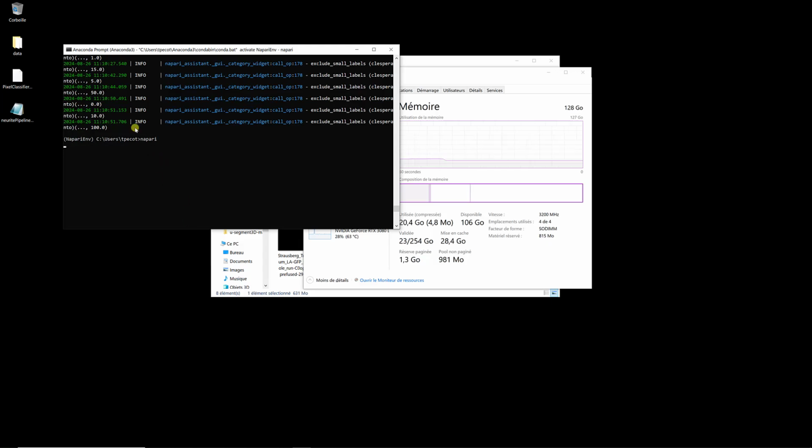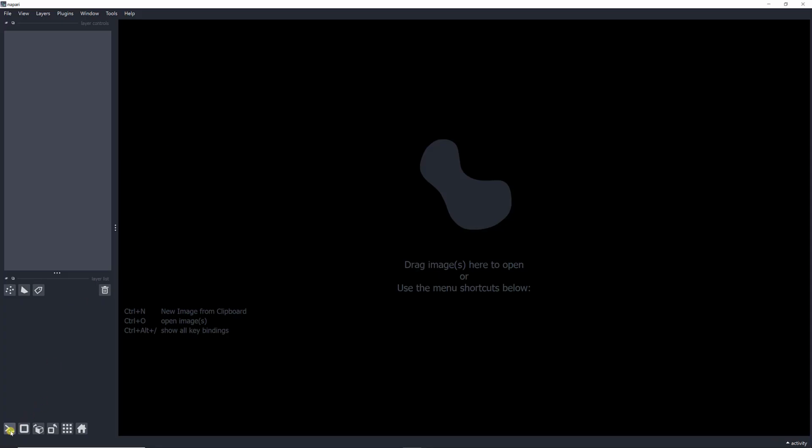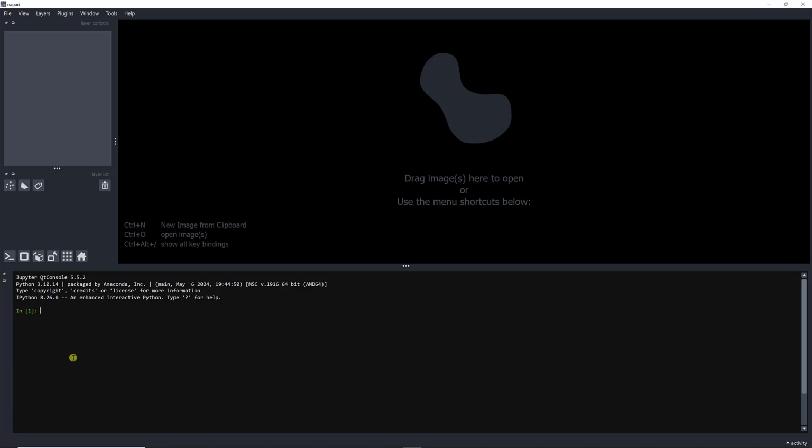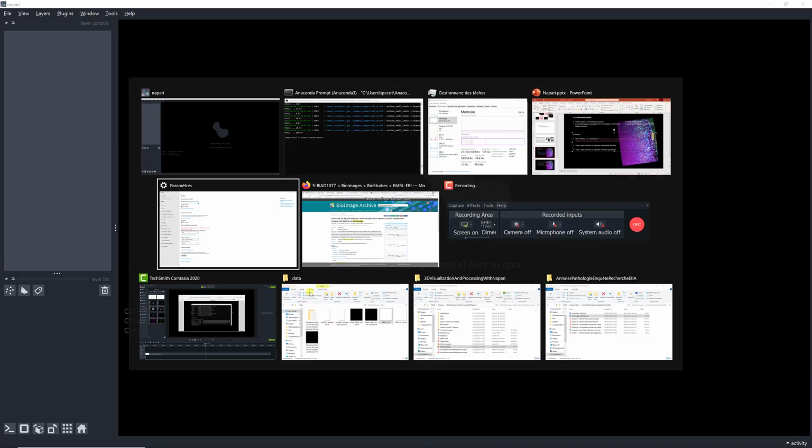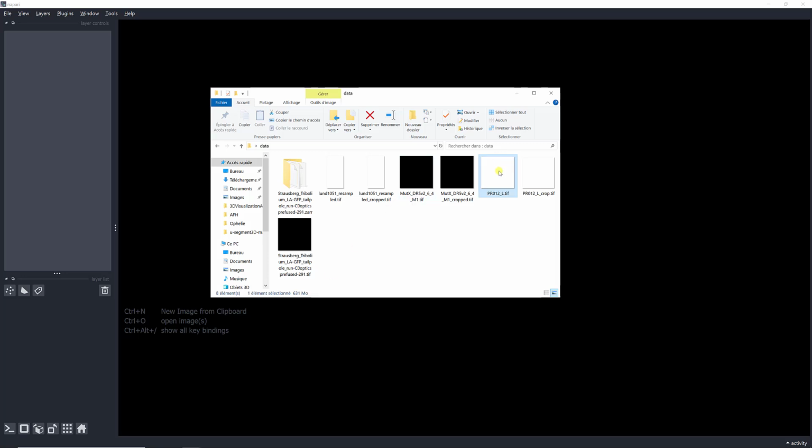So if I go back to Napari, so I showed you I need to change, to tell Napari which GPU to use, the nice thing is that these files, they are set up in the memory. So I just use the up arrow and I can get them back. I'm gonna open the image again. So let me go to my data. If I open the image again, get the different channels. I'm gonna remove the channels I'm not using.